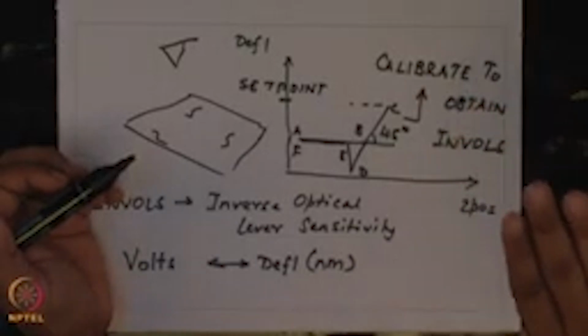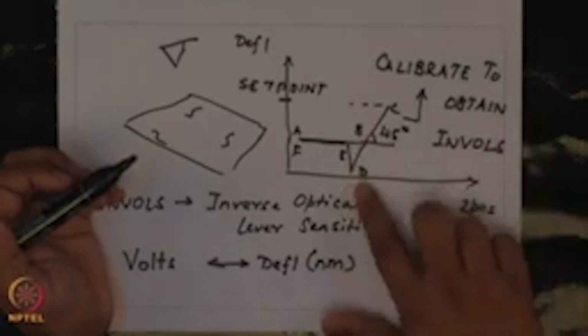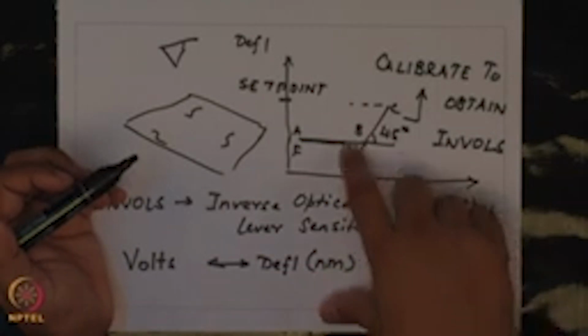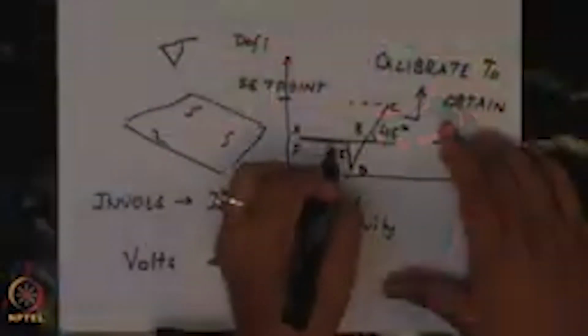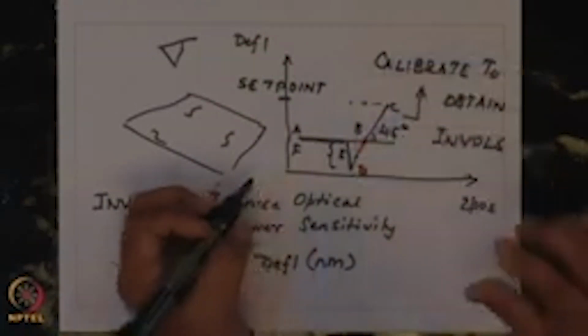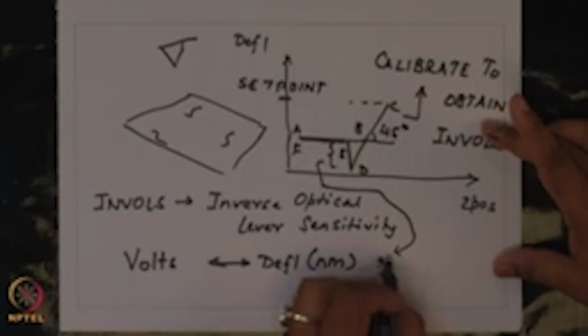So, the tip is now coming up. While it is coming up, you get this huge peak in the force curve, between point D to E. What is this? This is basically when you have actually indented the surface, you have formed some non-specific bonds. Now, as the tip is trying to come off, those non-specific bonds have to break, and this is that. So, this force peak is what accounts for non-specific adhesion.